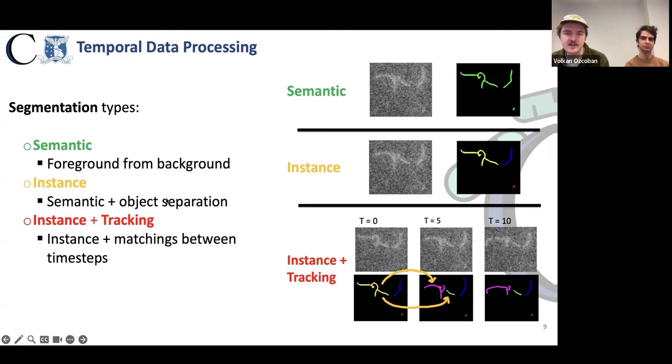For example, in self-driving cars, you don't have one person turning into two in the next frame, while you have situations like the one in the bottom right of this figure, where the mitochondria in yellow turns into both the ones in pink and green in the next frame. You can see this. I don't know if you can see my mouse, but through here.